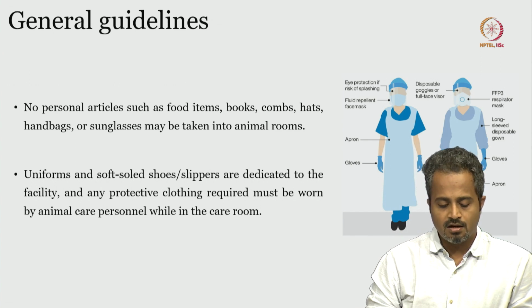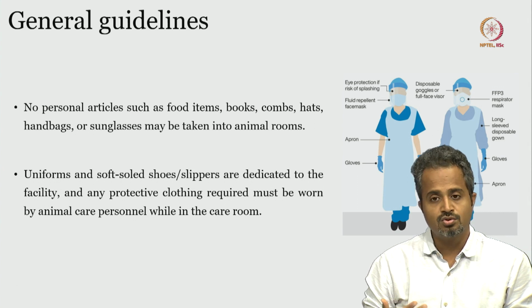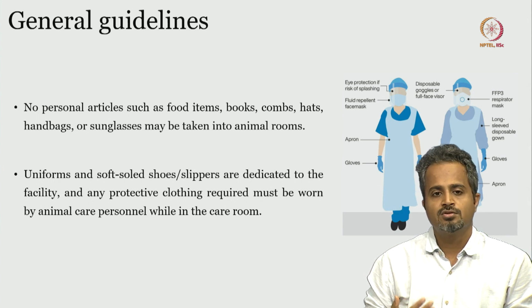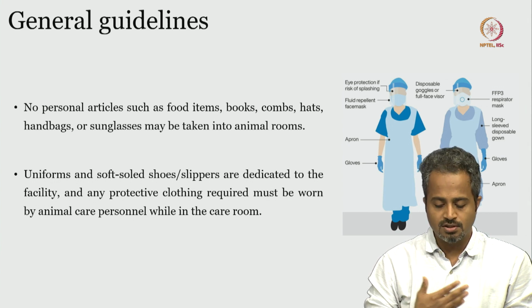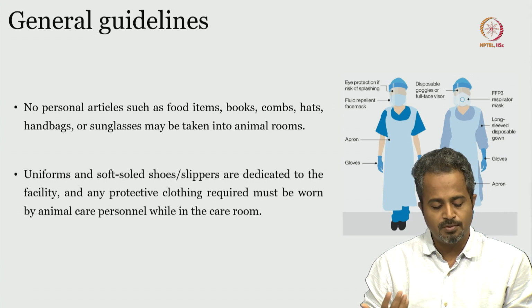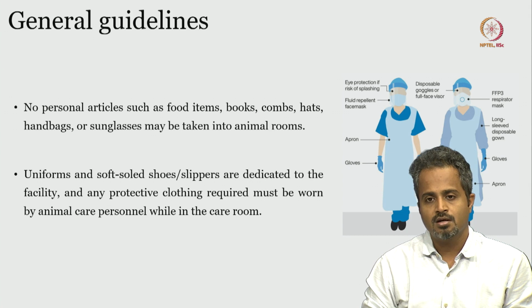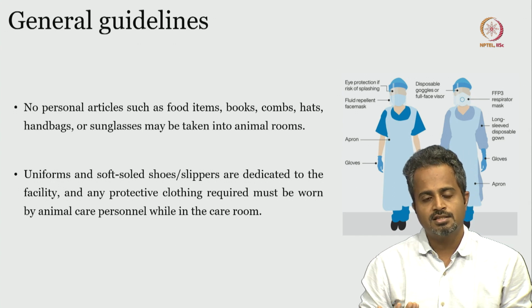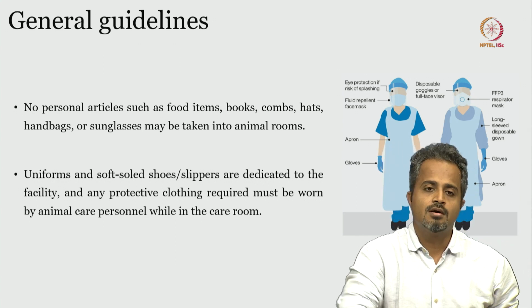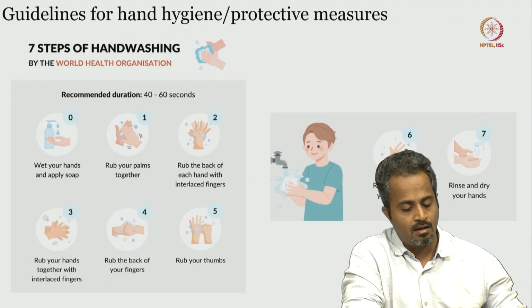And as I said, there are uniforms, there are scrub suits, and there are soft sole shoes or slippers which are dedicated to the facility. So these can be used, and of course any protective clothing required must be worn by the animal care personnel while in the care room. Okay, so that's very important. The dedicated dresses have to be worn, and avoid your personal articles from entering the animal facility.